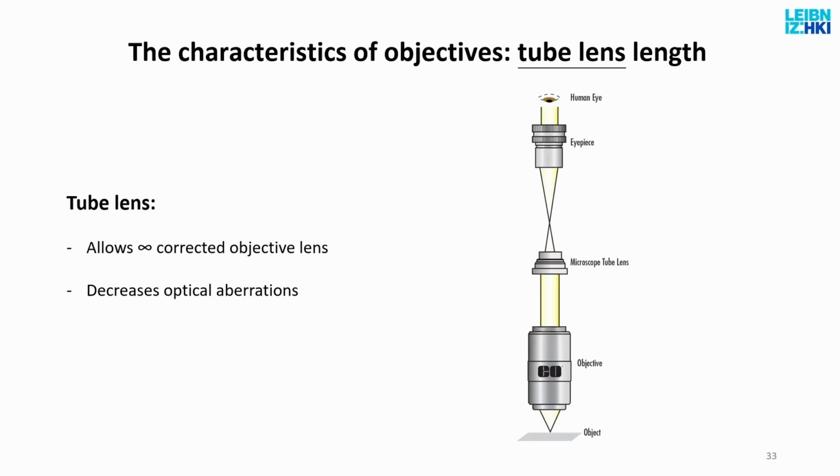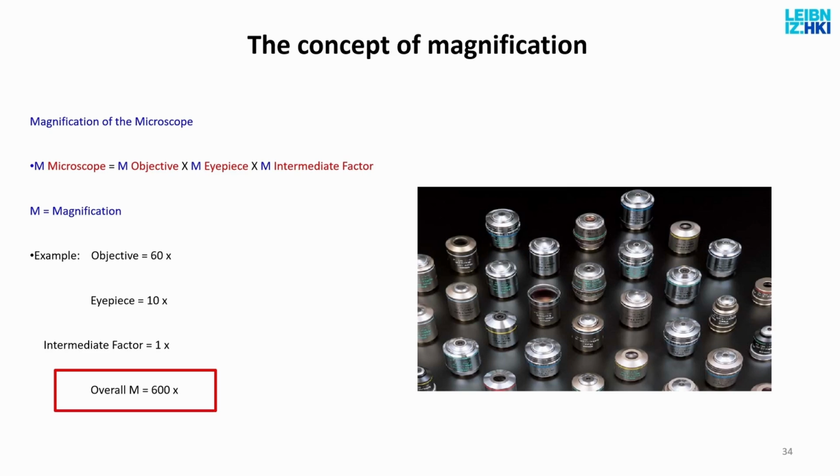And this is the tube lens that I told you about. So to make the light path here parallel, we have this extra lens, and this is something you can check by looking for this infinity signal. And there are a million lenses, blue ones, old ones.